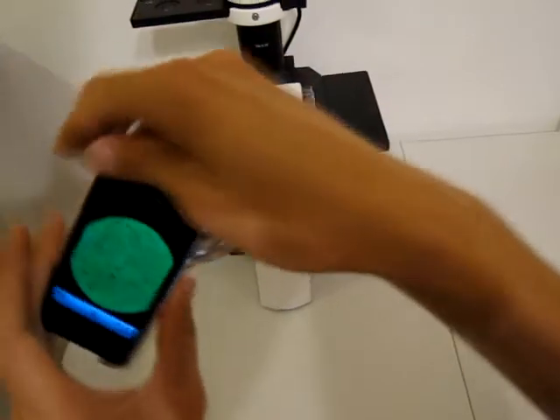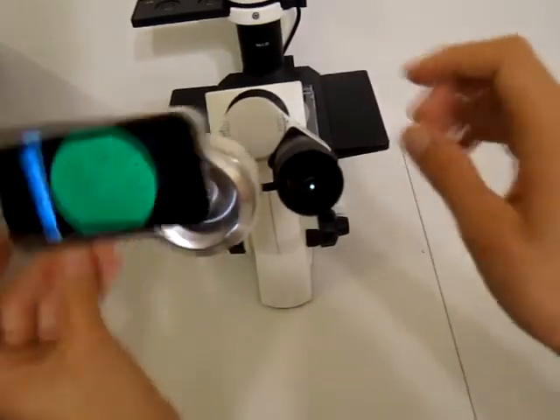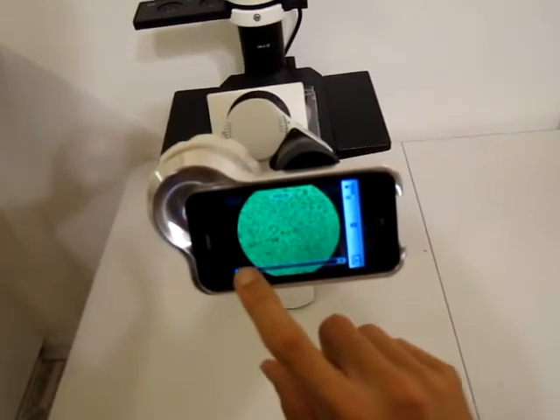You can also turn it down like this in a different position, and you can zoom in and out using the iPhone.